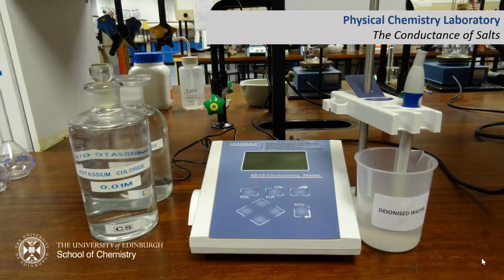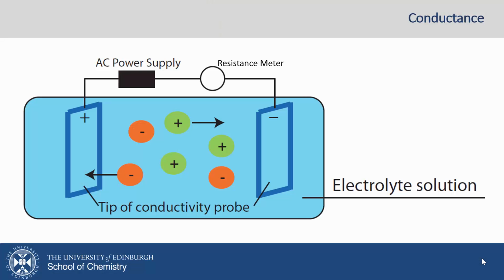Welcome to this pre-lab video on the conductance of salts. The diagram here shows a conductivity cell. When a voltage is applied between two electrodes in a solution, it induces negative ions to migrate towards the positive electrode and positive ions to migrate towards the negative electrode. This movement produces a current, and the resistance gives a measure of how difficult the motion of these ions is.